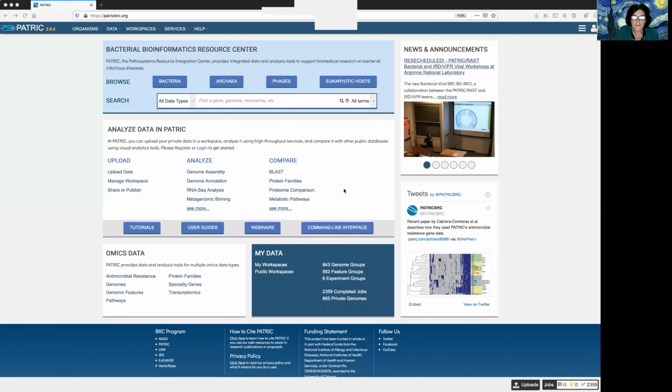Last time we talked about the report that comes with any of the codon tree jobs. Now I want to walk you through some of the other files that come with any job. So let's find our job. We'll go into it a different way.